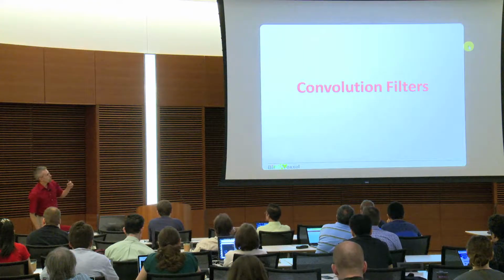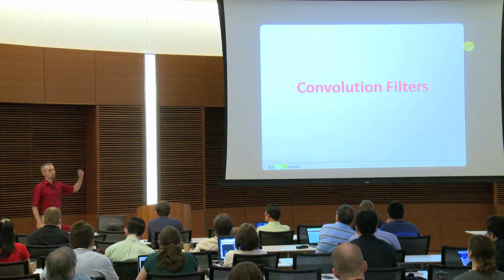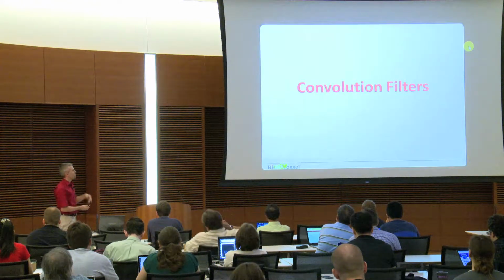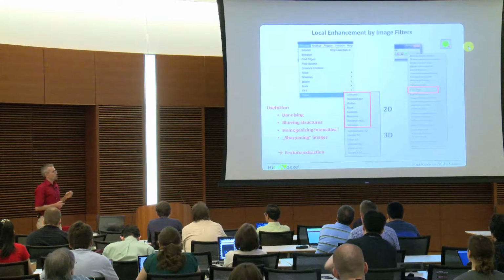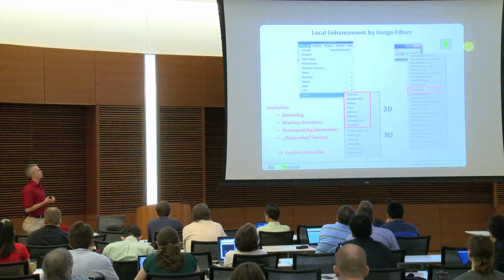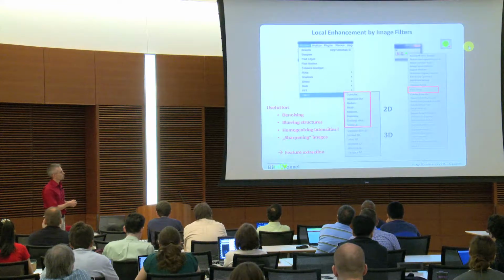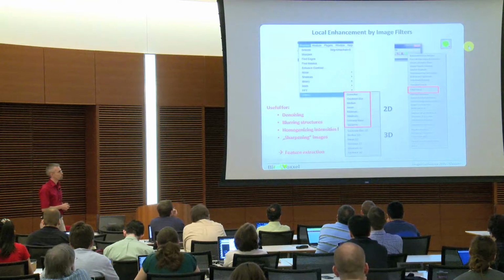So besides those functions, enhancing the contrast, subtracting the background, we often also need to think about filtering our images before we want to extract them, because that might make things clearer, better visible, or actually eliminate things we don't want to extract. I don't want to go into details explaining the filters. Ari has done that actually very well already. Just to show you where can you find them again. Process filters, there are the basic filters for 2-dimensional and the same ones for 3-dimensional images.